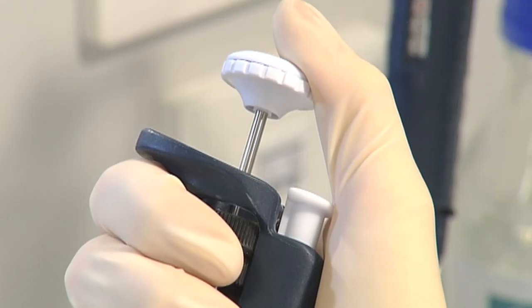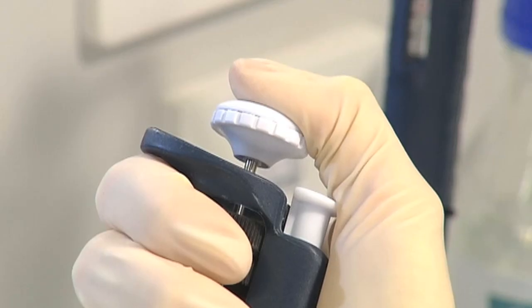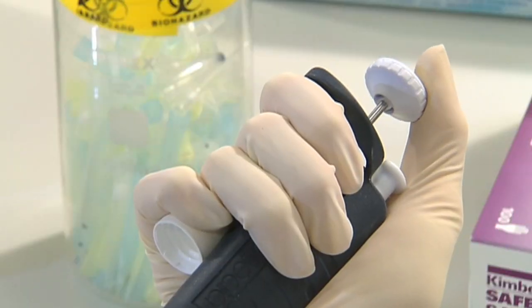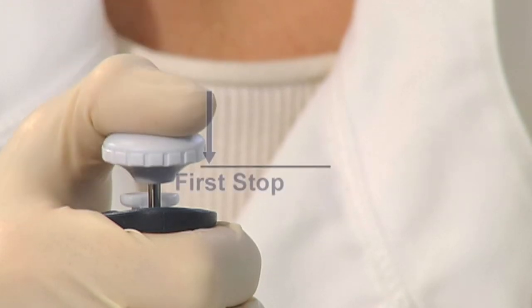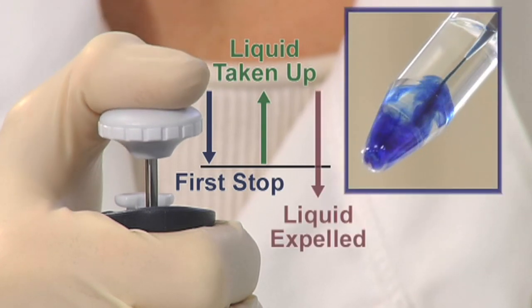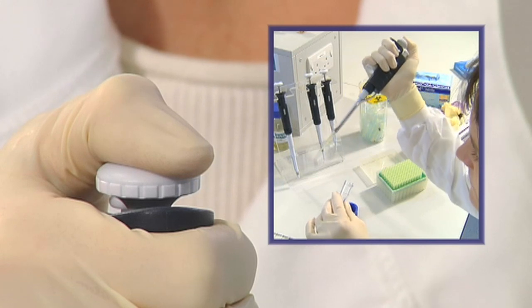Withdraw the pipette tip from the liquid and place it inside the recipient container. Slowly push down on the push button to release the liquid into the tube. This time, push beyond the first stop — this ensures any residual liquid is expelled from the pipette tip. Fully withdraw the pipette tip from the liquid before you release the push button. To recap: push down to the first stop, place in the liquid, slowly release, then push past the first stop to fully expel the liquid, and withdraw before releasing the button.